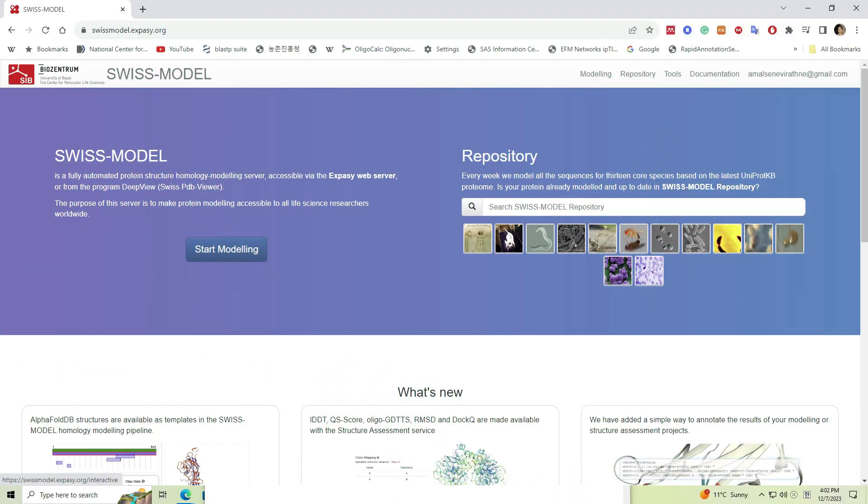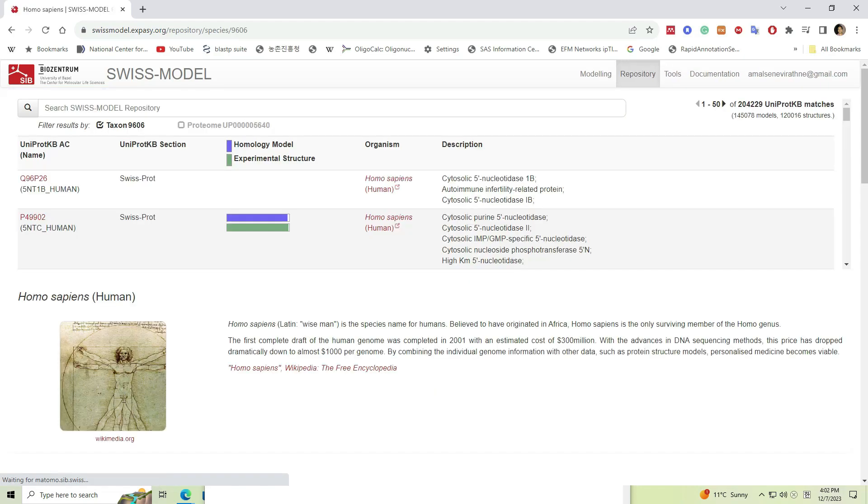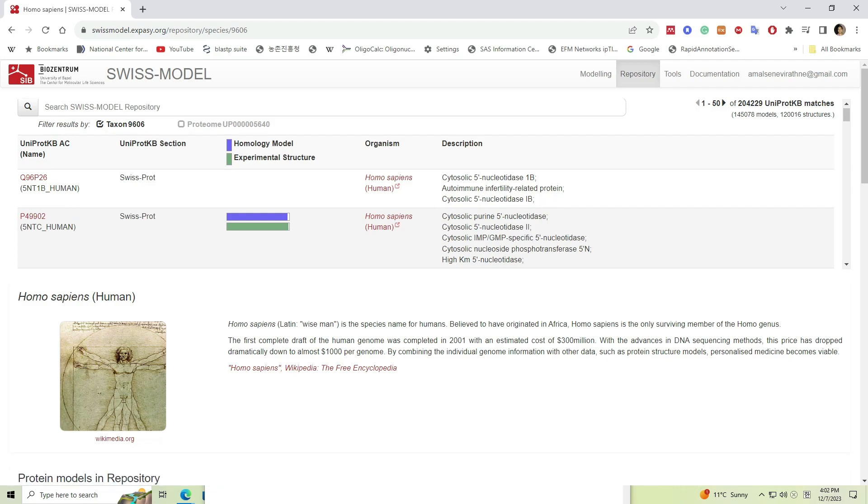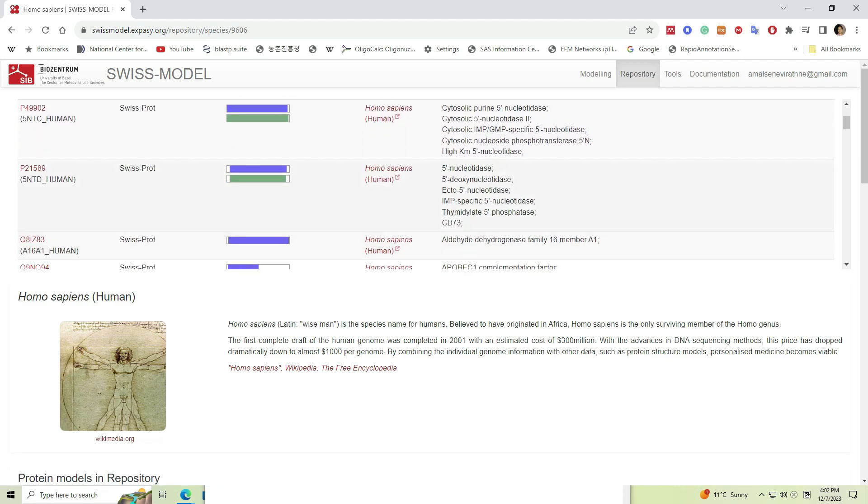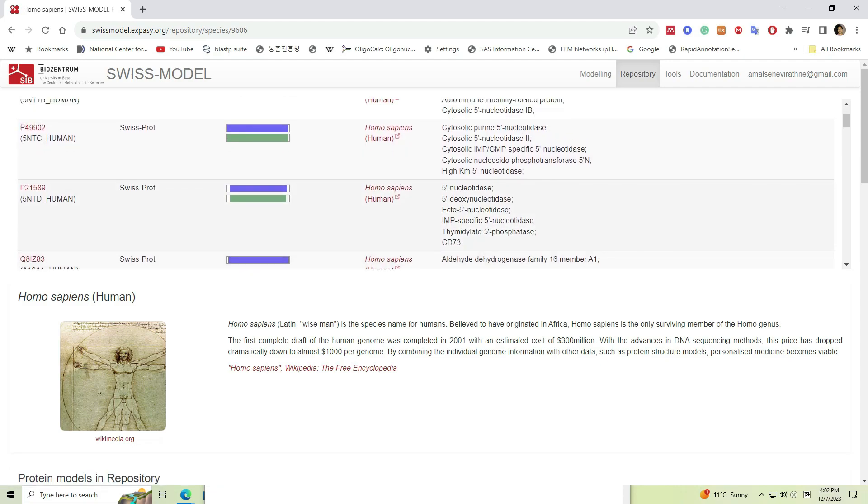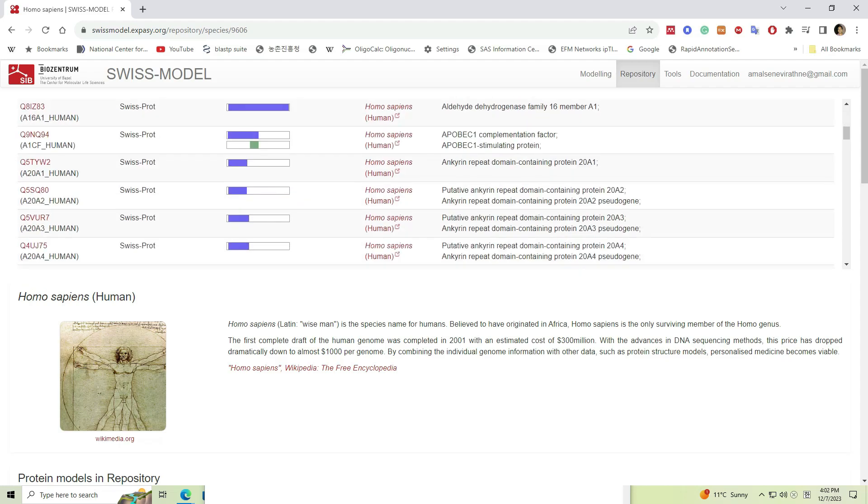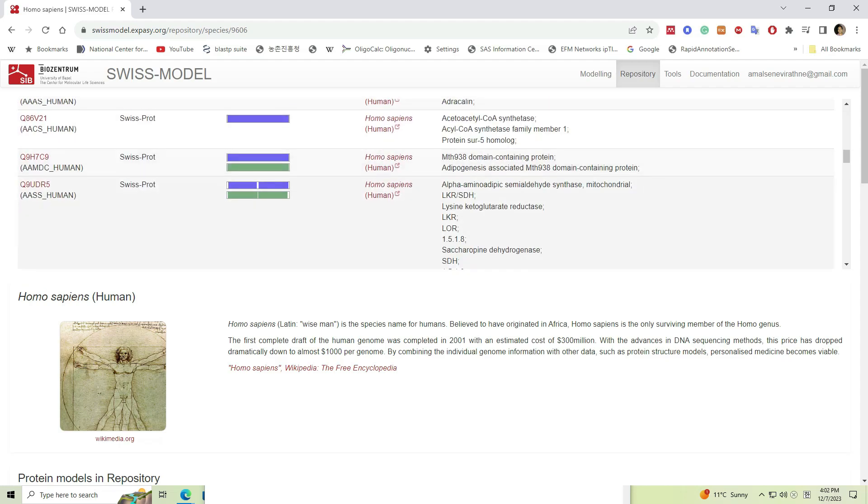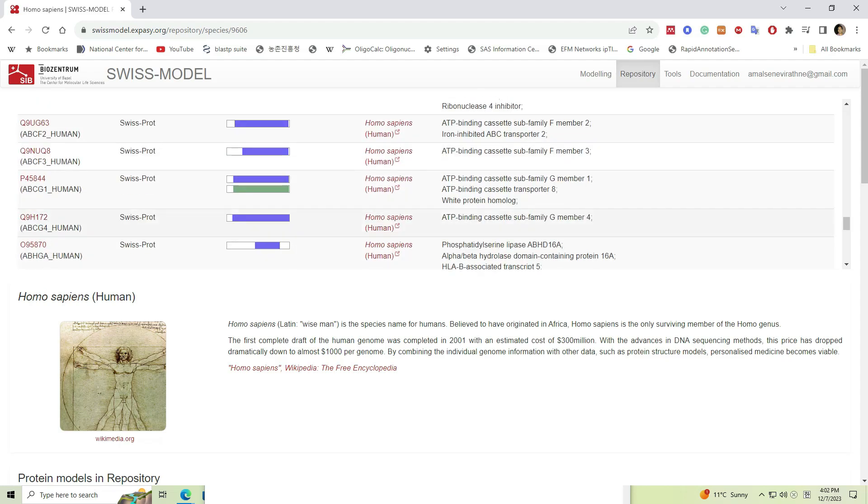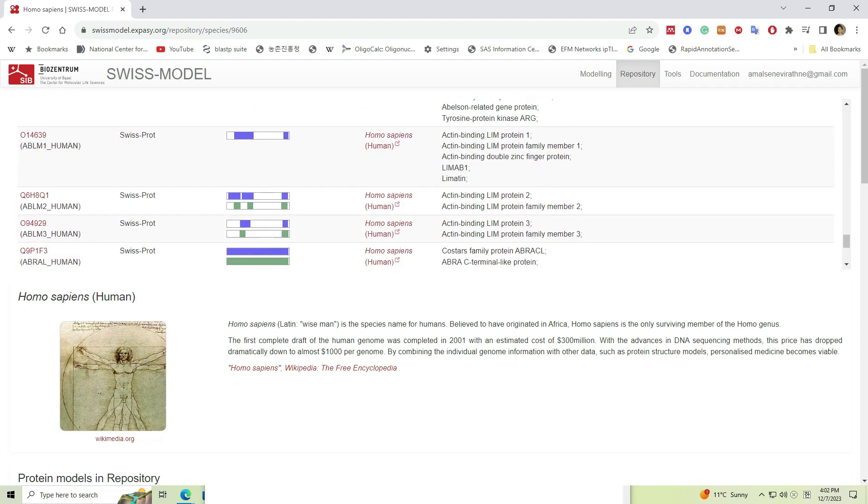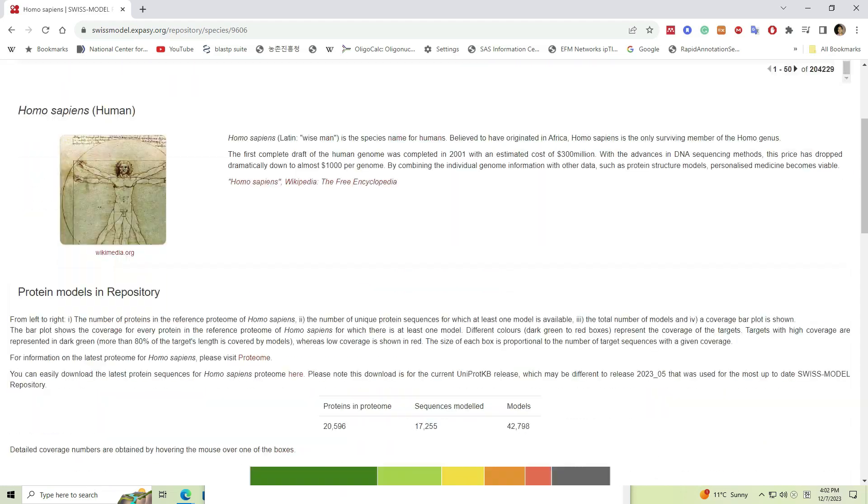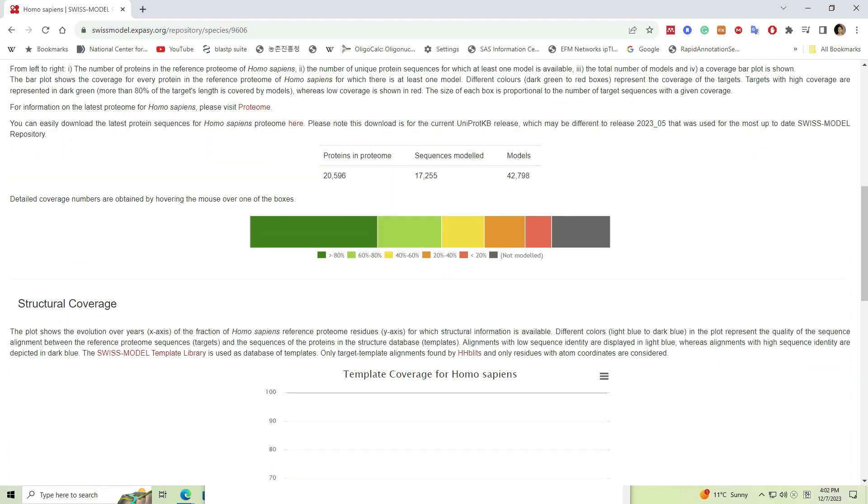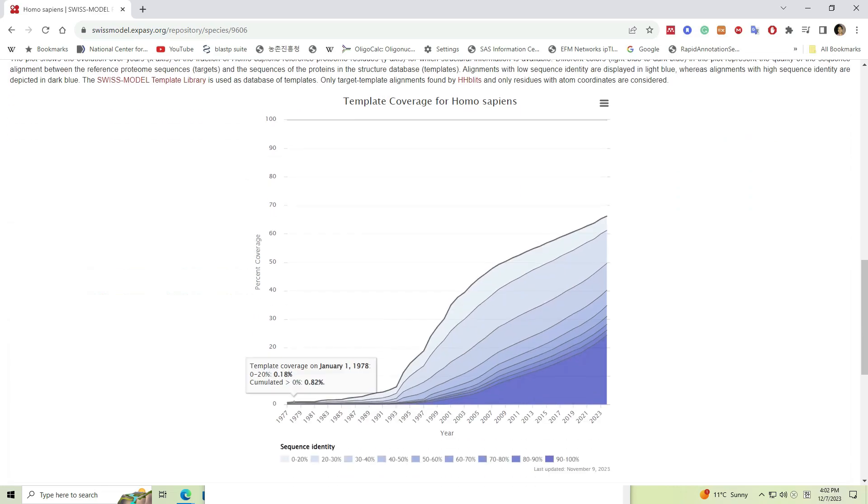SWISS-MODEL is a state-of-the-art platform for homology modeling, a computational technique widely employed in structural biology to predict the three-dimensional structures of proteins based on its amino acid sequence. We have to rely on modeled proteins due to the fact that crystallographic structures have been experimentally determined only for a fraction of proteins available in biological systems.